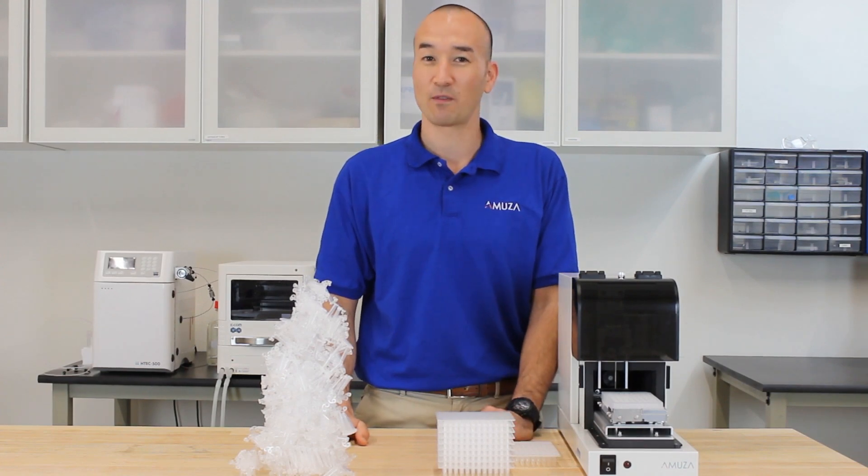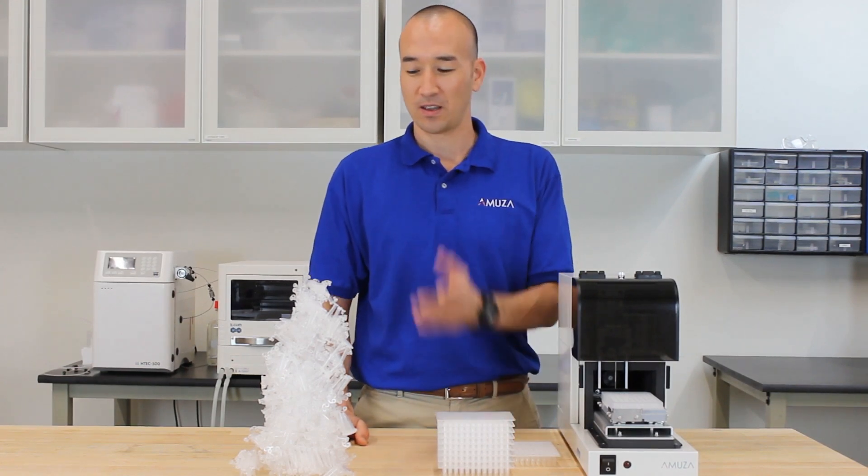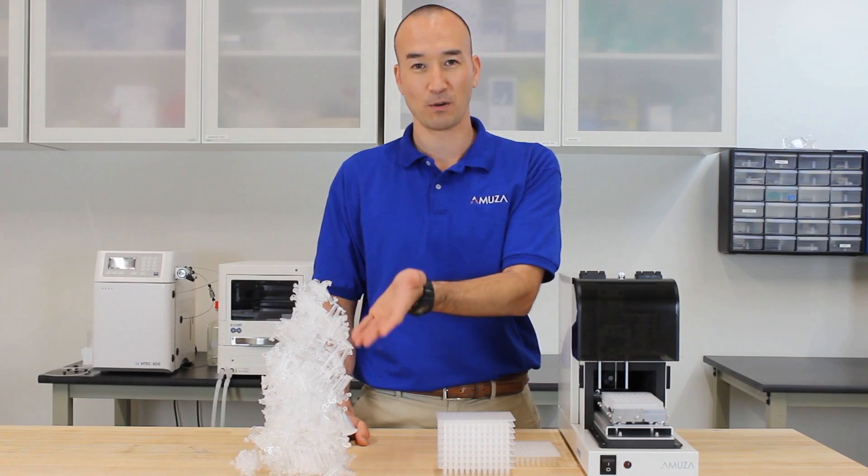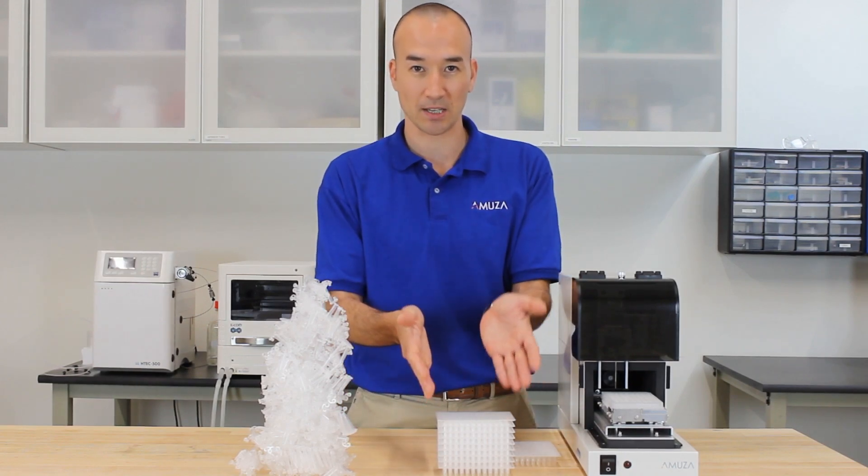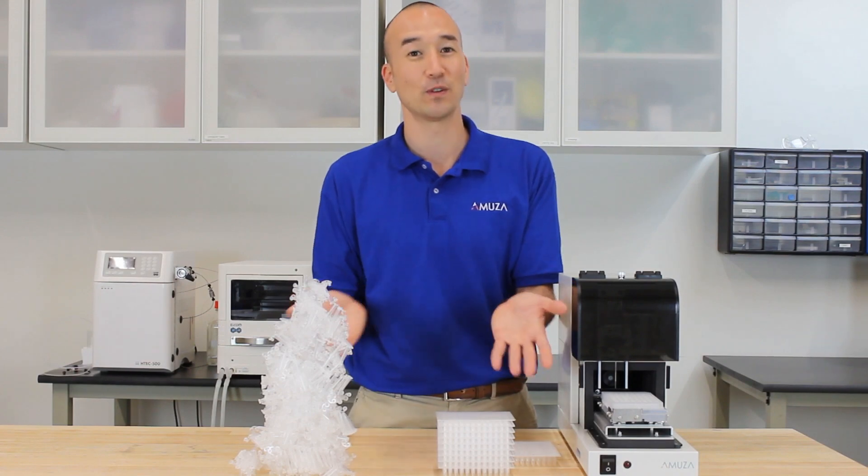The last point I'd like to address is the environmental impact. Here, the number of vials is exactly the same as the number of wells in the 96-well plate over here. The difference is quite clear.